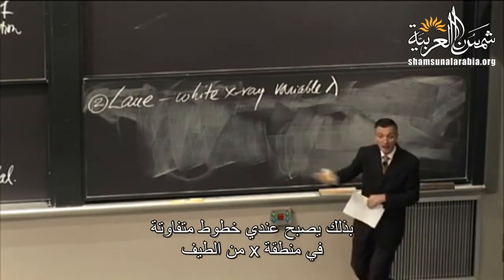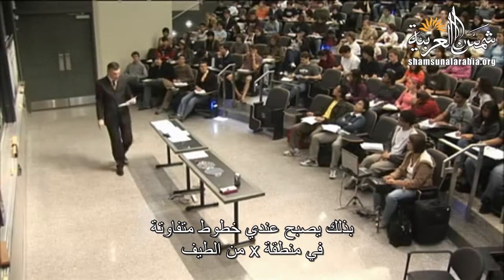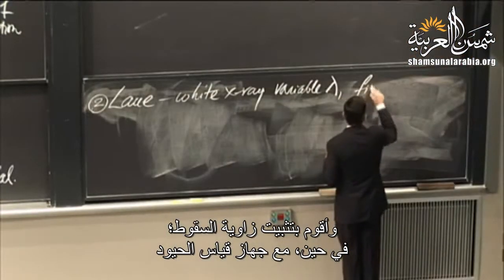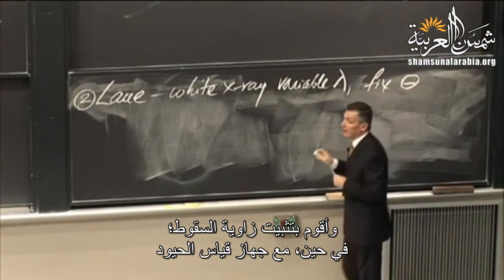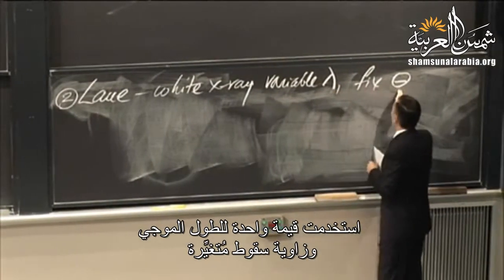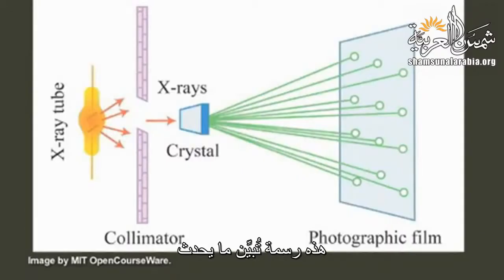So now I've got lines varying all across the X-ray region of the spectrum. So I use variable lambda and I fix the angle of incidence. Whereas with diffractometry, I use a single value of lambda and vary the angle. So here's the cartoon that shows what's going on. I'll do it here one more time.